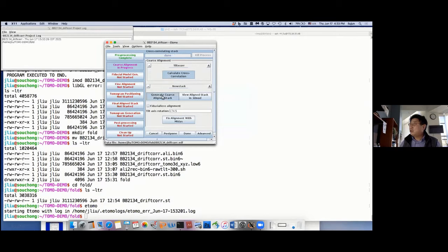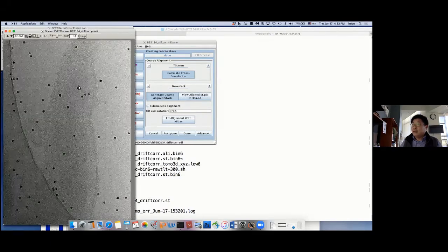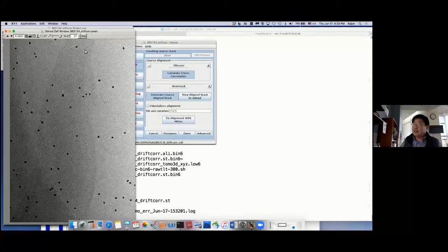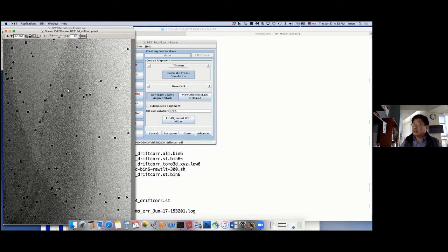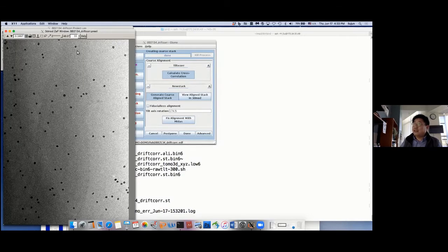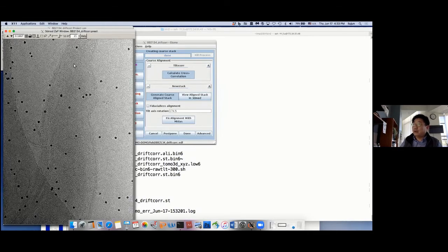When you finish, you generate an alignment file. As you remember, the original image is moving around like crazy. Because we're using a strategy called tracking after, basically without pre-tracking, that saves time, but the generated data is not ideal. Now we can see, because they already did cross correlation alignment, they are much better than the previous one I showed you, right? So that's good, but still not perfect. You can see them jumping around. I expect the room doesn't see the jumping well, but it's not perfect.